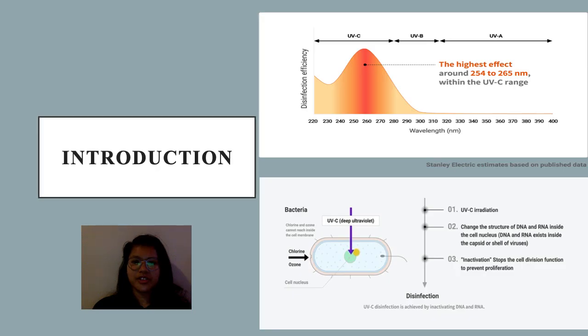The researchers decided to work around the topic UV LED as there has been much advancement throughout the years, and UVC has been used as water treatment for several decades now, but outside of this field, there has not been much advancement, specifically for surface disinfection. It was discovered that specifically the UVC region with the wavelength of 254 to 265 nanometers has the highest inactivation rate for bacteria.